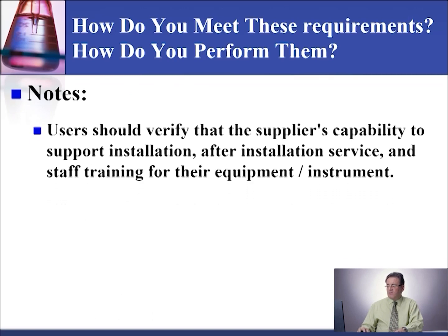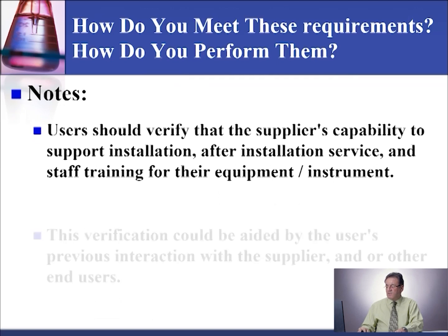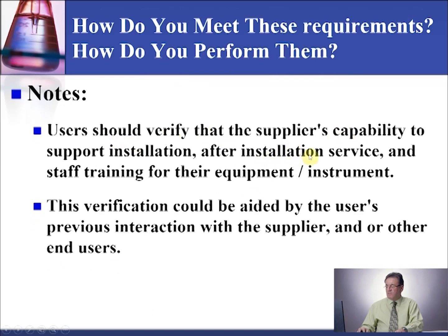Also, you need to do test validation and verification using method comparison and validation verification. You need to review it for full detail, or go back to the lecture about the validation and verification of qualitative and quantitative tests or methods. The results of the PQ verification need to be documented on a form like the performance qualification form, and approved by the medical director or designee.